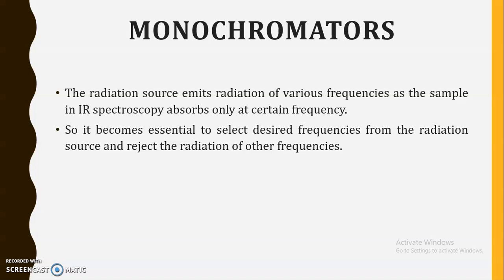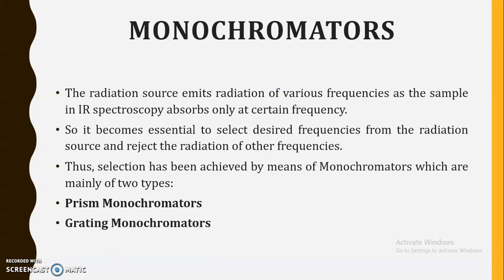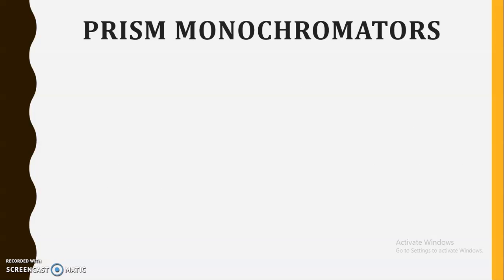So it becomes essential to select the desired frequencies from the radiation source and reject the radiation of other frequencies. That can be done with the help of monochromators. The selection is achieved by means of monochromators, which are mainly of two types: the prism monochromator and the grating monochromator. Grating monochromators are highly sensitive as compared to prism monochromators. Nowadays, instruments are generally made with monochromators made up of gratings. We will discuss both prism monochromators as well as grating monochromators in this video.